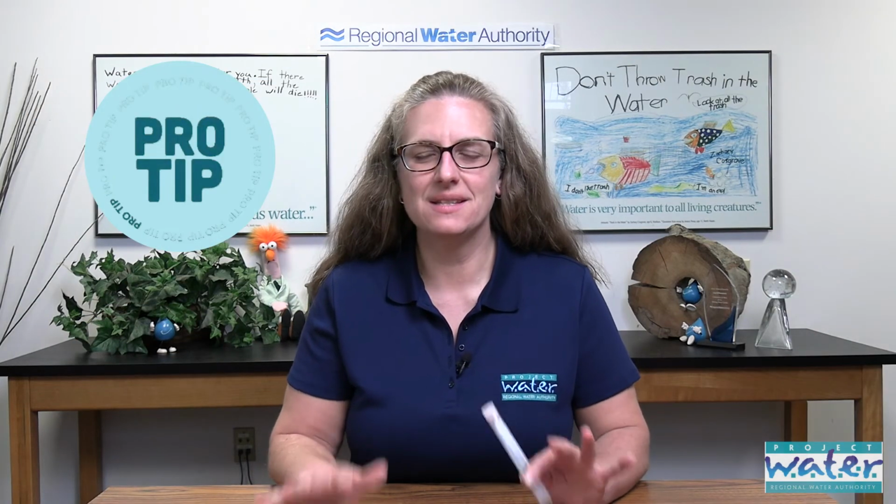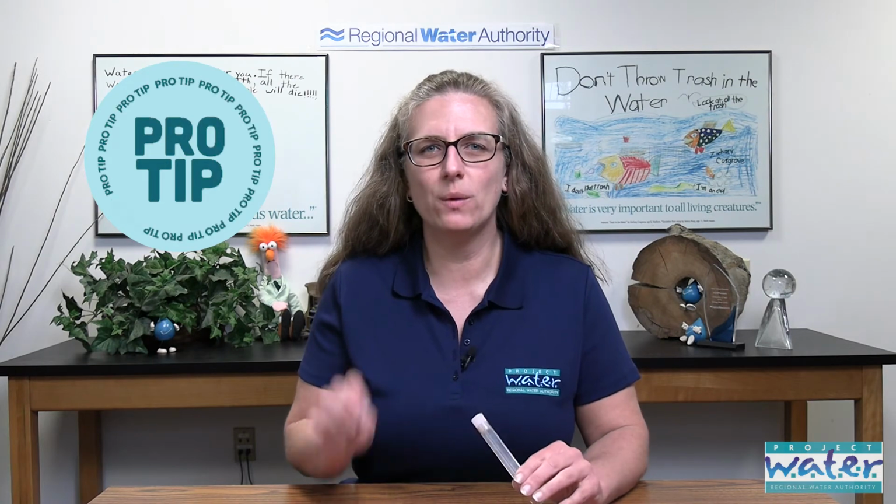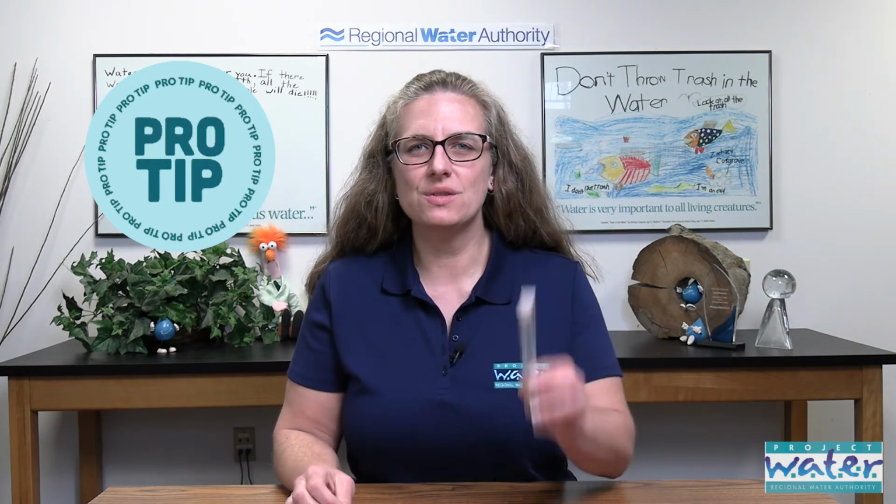Okay, teachers, this is the fastest way to pass out the nitrate 1 and 2 tablets. When the students are ready and they have their test tube filled to the 5 milliliter line, each group's going to take the cap off. They're going to hold the test tube.